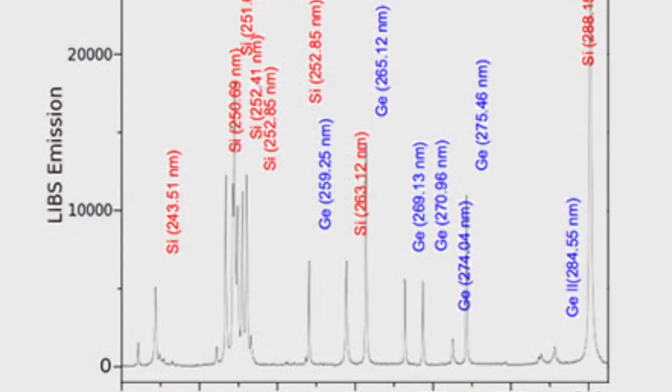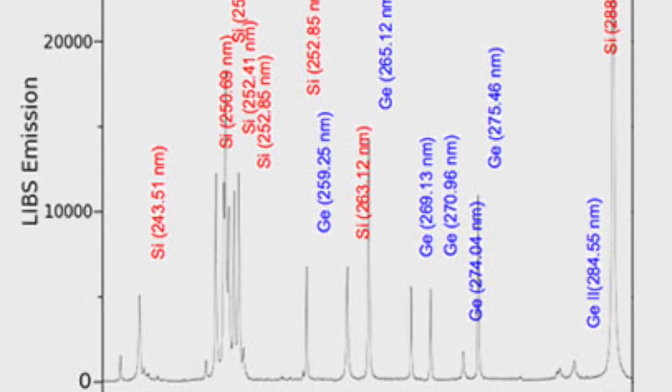The light is collected from a lens or optic cable on a spectrograph, which measures wavelength and intensity at specific wavelengths. Using computer software, graphs can be made plotting wavelengths and intensity, creating spectral lines. Software then compares the created spectral lines to known wavelengths to identify the elements present, then analyzes the intensity of the spectral lines to determine the concentration of those elements.